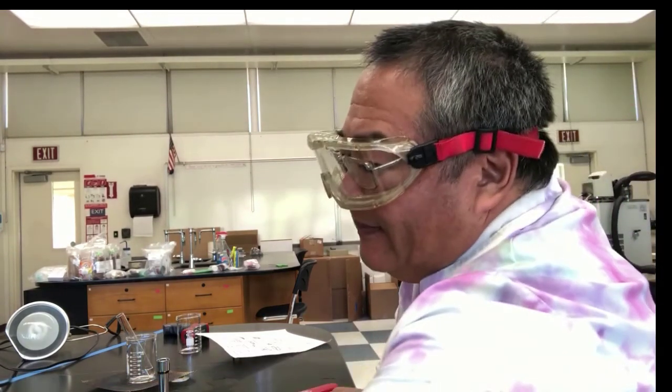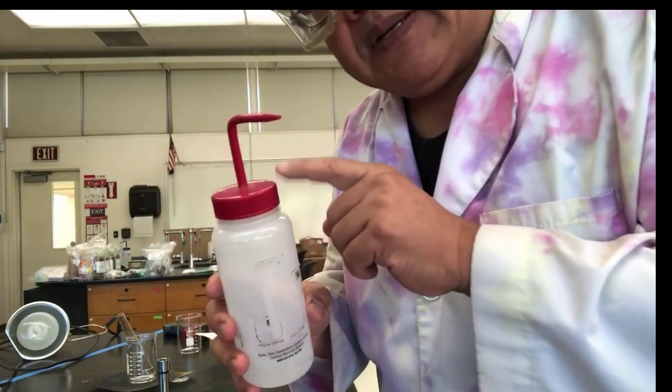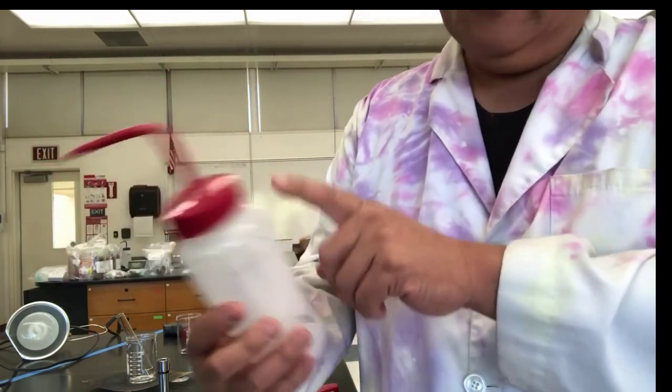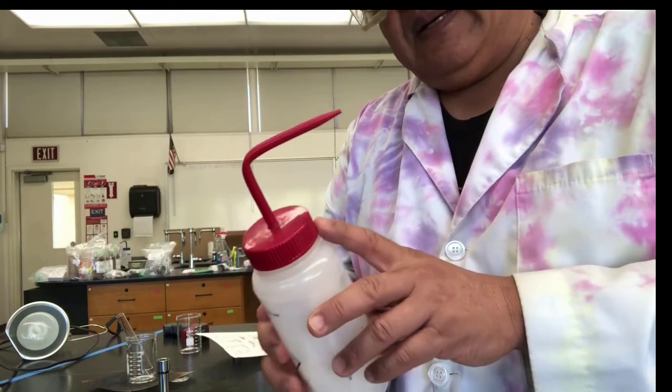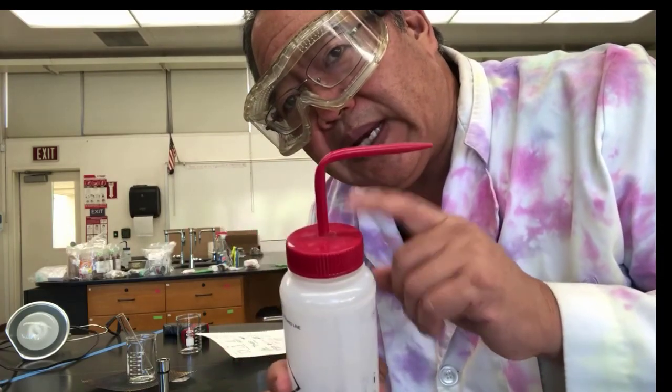Okay, so you're going to say to me, how do I know it's a flammable liquid? The cap has a different color. Right, water, it's blue in these labs. This is actually acetone, and some of them are green for like methanol. I don't think we have any of those in here, but this is red and this is usually acetone. Sometimes it's ethanol, but typically it's acetone. You need to be careful when you see this lid that you take it off of the work area, and then you can stick it over here by the window, or, let's stick that in there in the hood, okay?